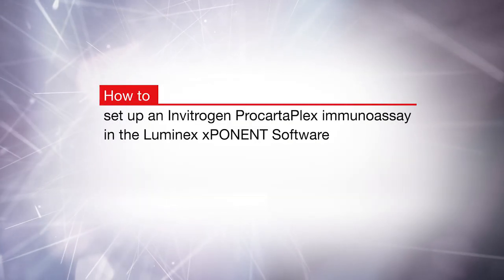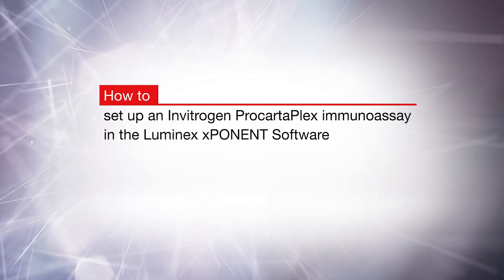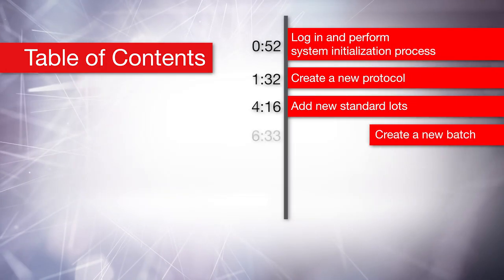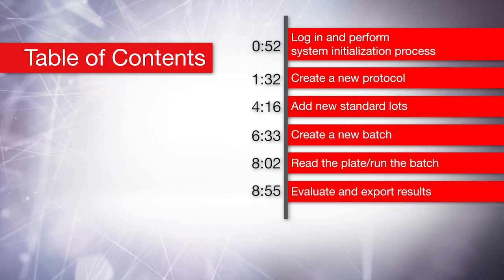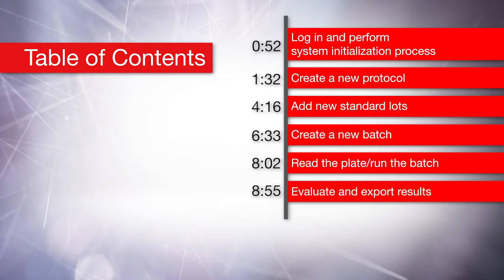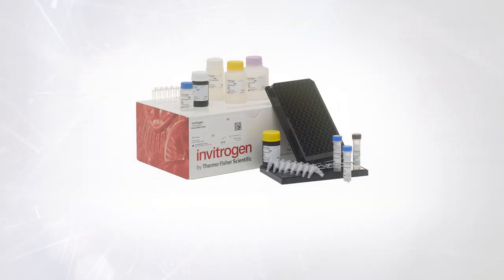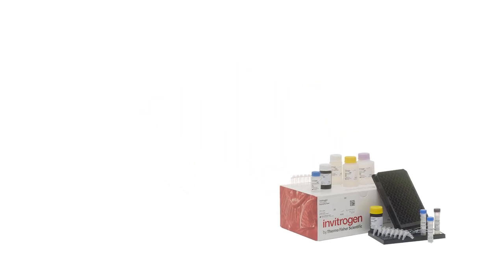In this video, we will demonstrate how to set up an Invitrogen ProcartaPlex immunoassay in the Luminex xPONENT software. For the purpose of this video, we will demonstrate with a human immune monitoring 65-plex panel and will reference the xPONENT software for a Luminex 200 instrument.